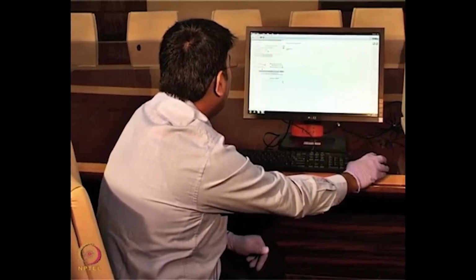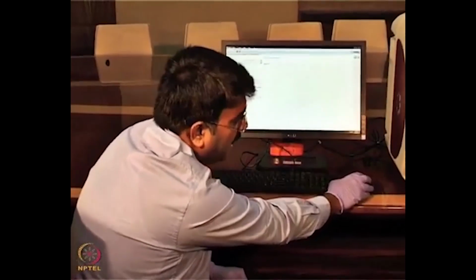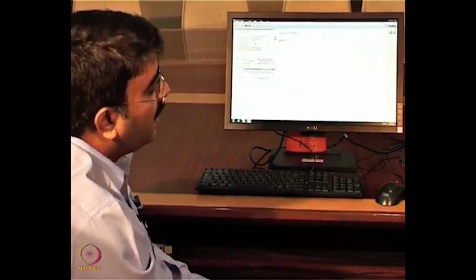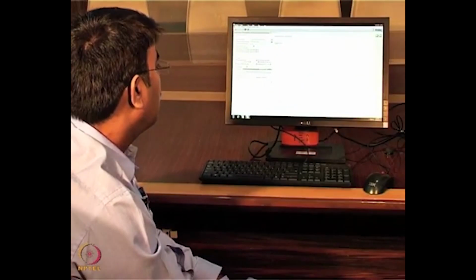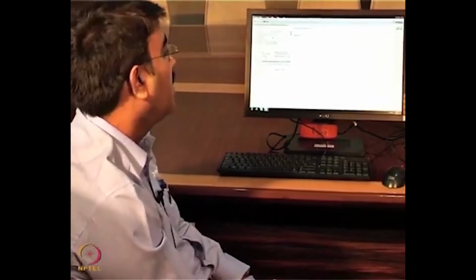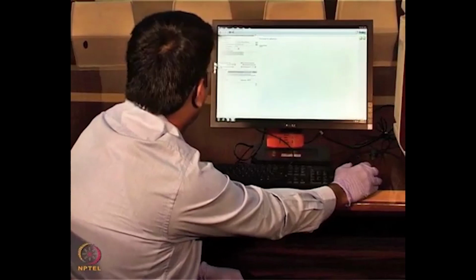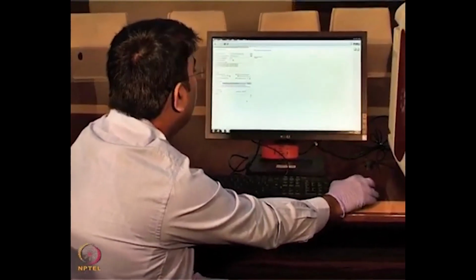The second option is whether, during the hydration, your sample has to be under shaking conditions, because the instrument has a shaker and it will effectively mix. In some cases it is required, in some cases not. You know that shaking sometimes enhances aggregation. So we can uncheck this. Also, I think prior to the experiment we already started a hydration of the sensors. Now the sensors have got hydrated, so we can directly uncheck this and go for the experiment.